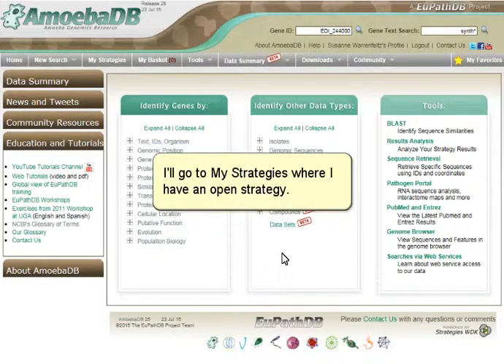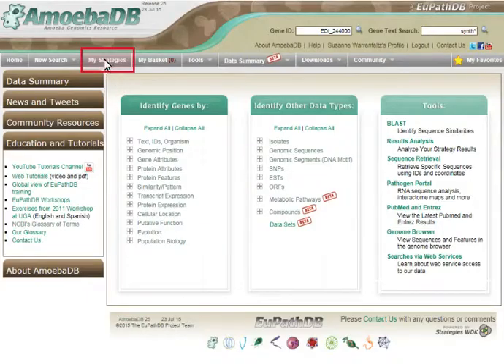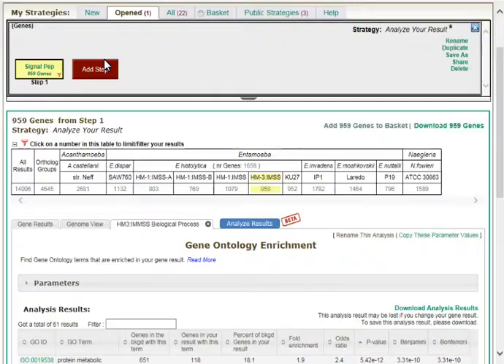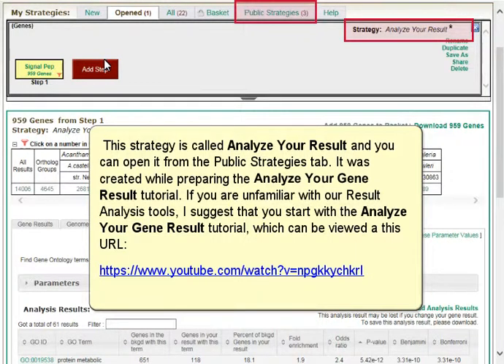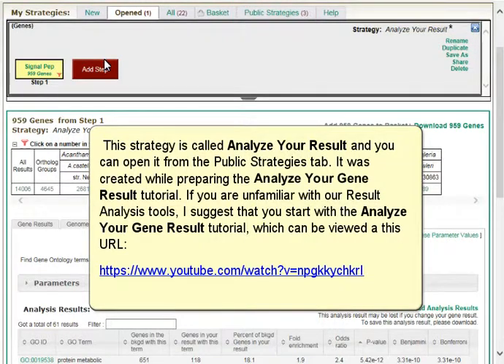I'll go to the My Strategies section where I have an open strategy. This strategy is called Analyze Your Result, and you can open it from the Public Strategies tab. It was created while preparing the Analyze Your Gene Result tutorial.